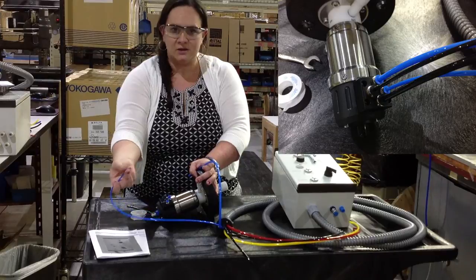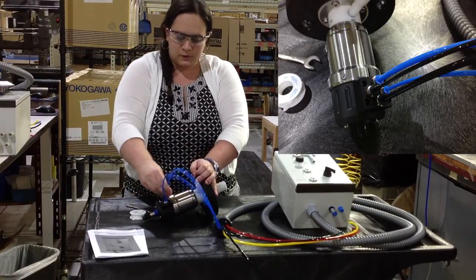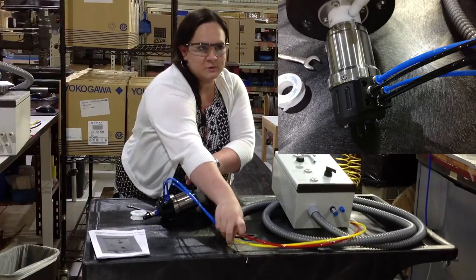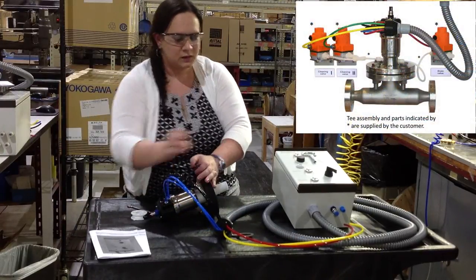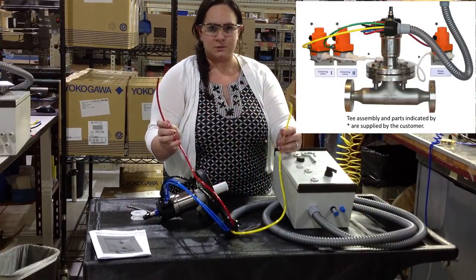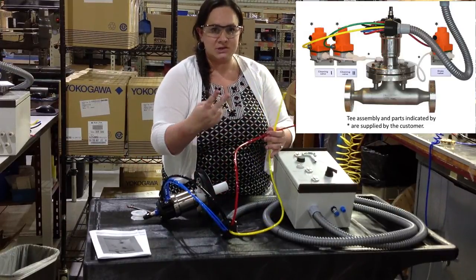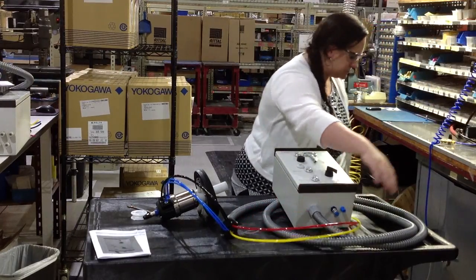If you ever need to remove them, you just simply push down and you can remove it. The blue and the two black cables control the position, whether it's in cleaning or process position. The other two go to pneumatic valves that we don't supply — they're supplied by the customer. The red goes to the drain, and the yellow goes to the cleaning solution. If you had a two cleaning solution system, there would be a third one going to the other cleaning solution.